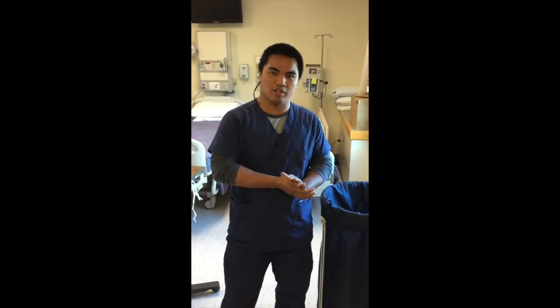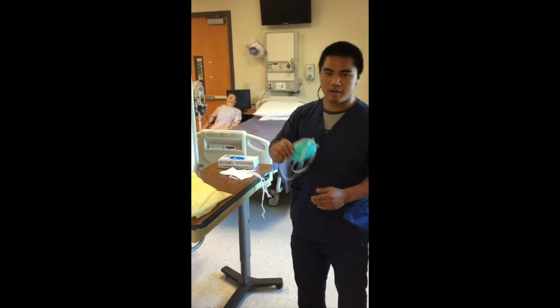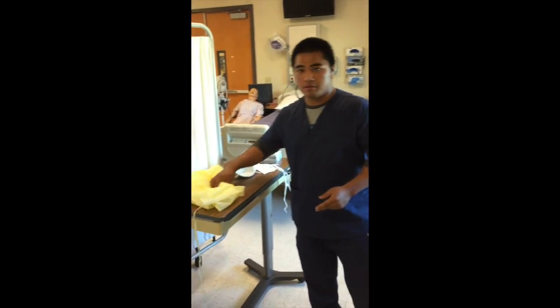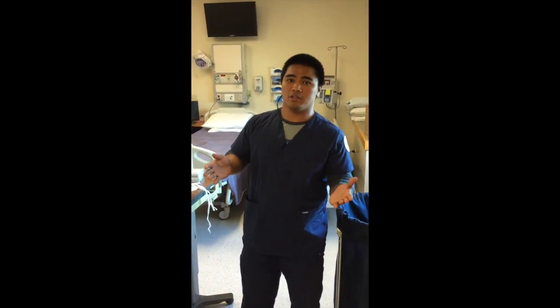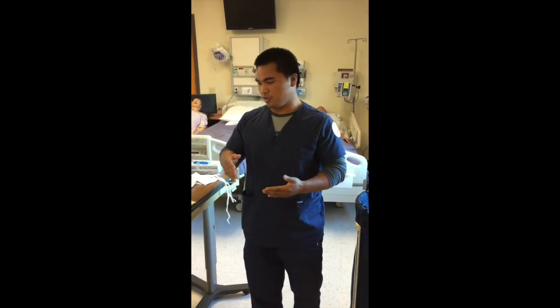And then the third transmission-based precaution that we have is airborne precaution, where you would wash your hands for 15 to 20 seconds. You would wear gloves, an N95 mask so you don't breathe in the air that's in the patient's room, a gown, glasses or eyewear, hair cap, and shoe covers. I forgot to mention that an example of an airborne precaution would be a person that has tuberculosis.